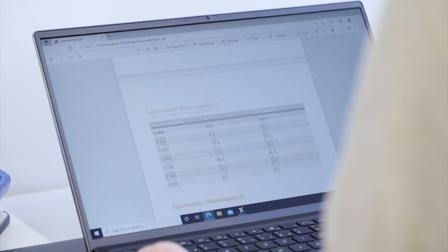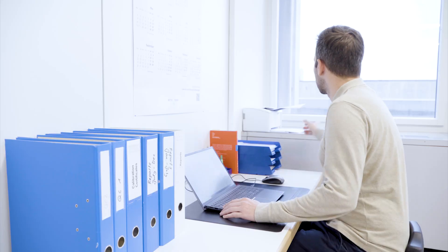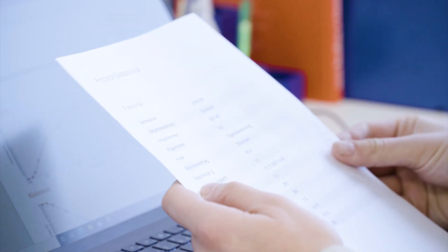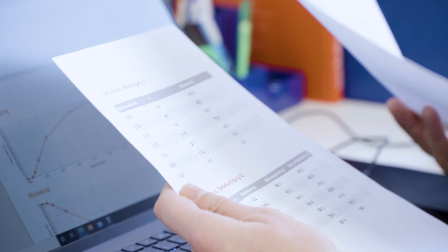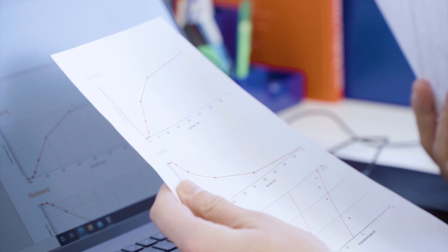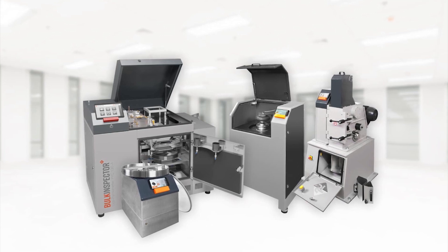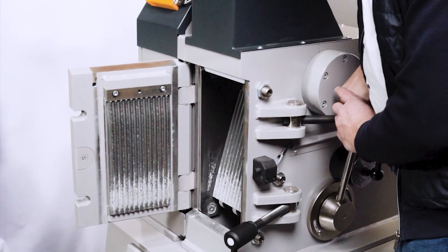Our machines and software ensure easy, quick, and convenient sieve analyses. The solution boosts your sieve analysis productivity — convenient features and digital data management quickly pay off. Automate your tedious sieve weighing tasks, increase throughput, and reduce cost per sample. Discover Zivtechnik Tema's extensive portfolio of laboratory equipment.